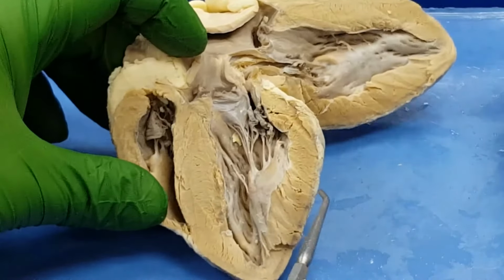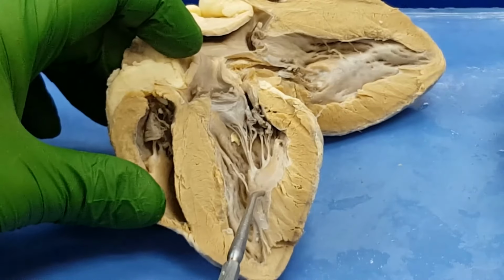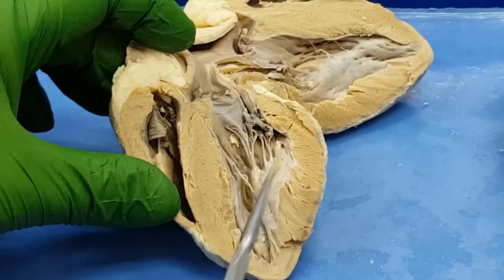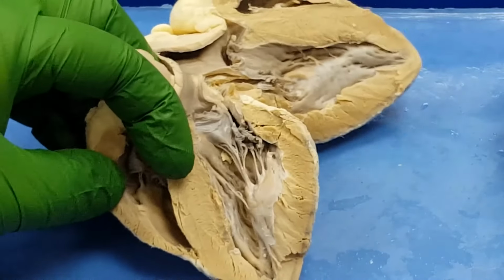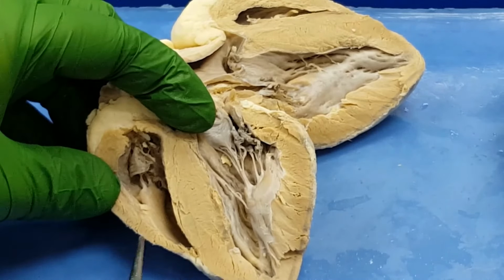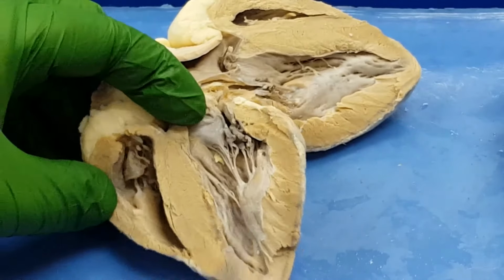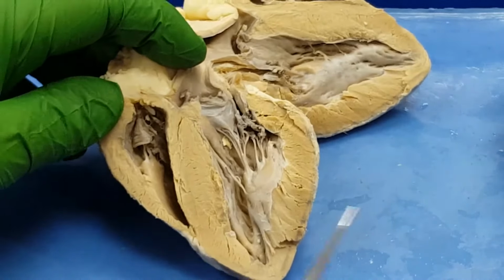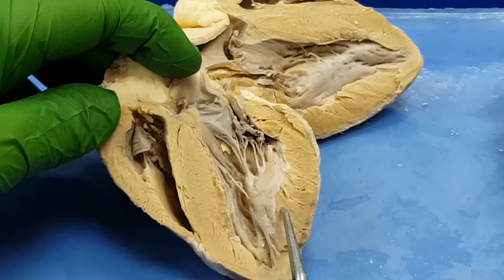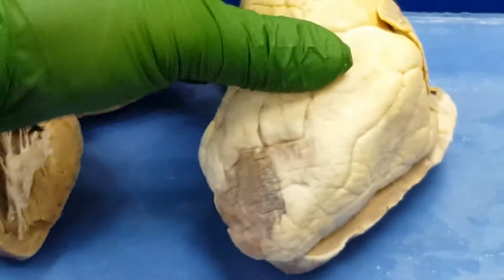So just like on the models, we have the epicardium right here, myocardium, which is the cardiac muscle tissue, and then I can see a little bit shiny right here, smooth looking, nice, slick, simple squamous epithelium. That's the endocardium. I can do the same thing over here in the right ventricle. Epicardium, the outside, myocardium, much thinner here, and endocardium, nice and shiny on the inside right there. So always using one of the ventricles for the layers is pretty standard because it's just easy to identify them. So epicardium, myocardium, endocardium. I could do the same exact thing with this larger sheep heart.